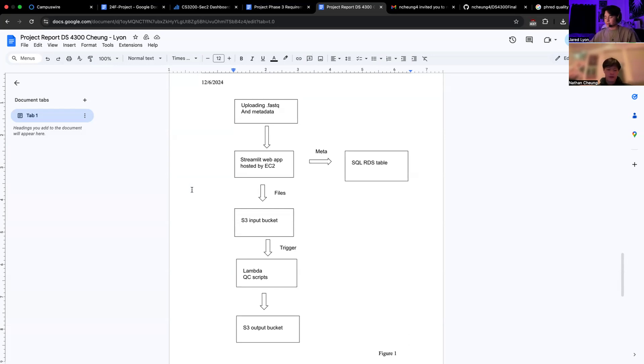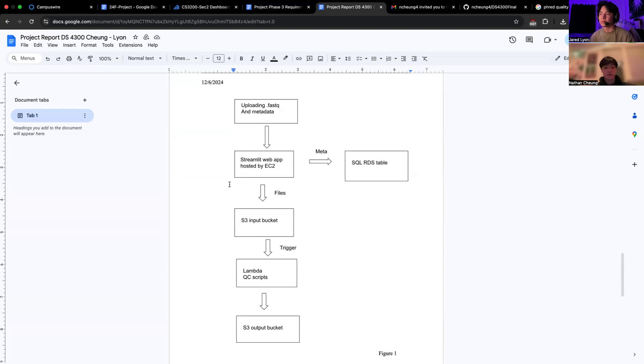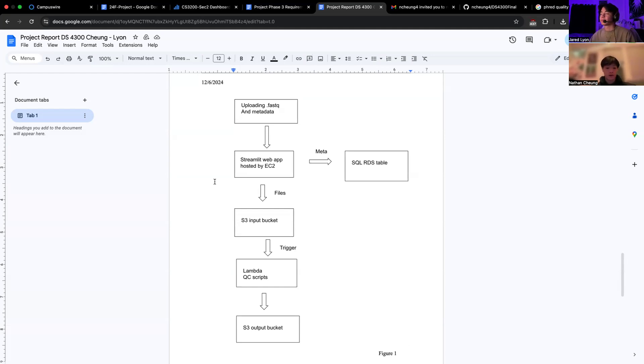We also calculate the Phred score, which is used to indicate the measure of base quality in DNA sequencing, which you'll see later in the demo, which is around 38 of really good quality.